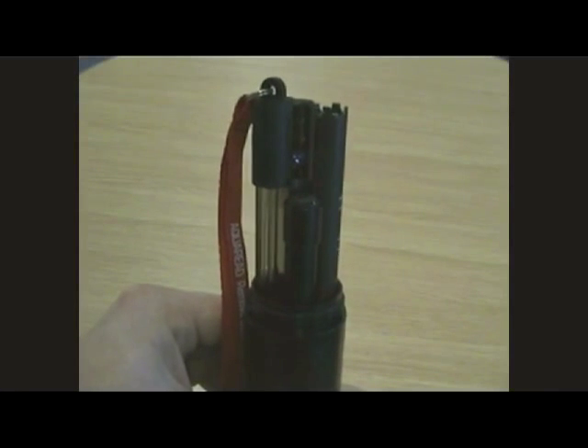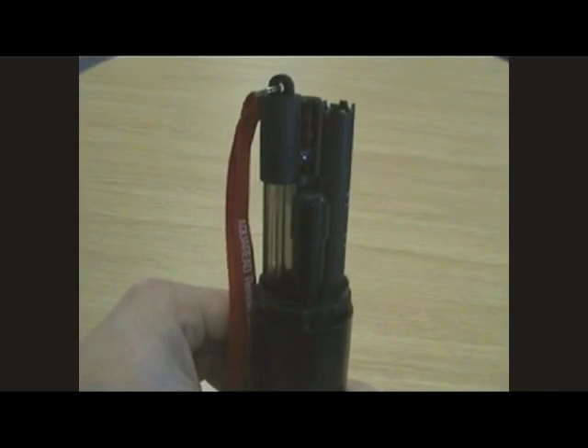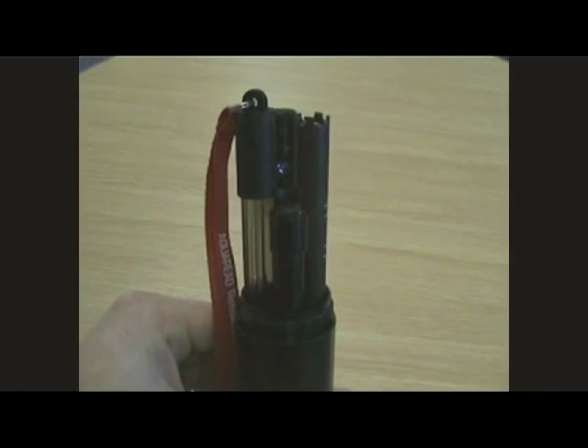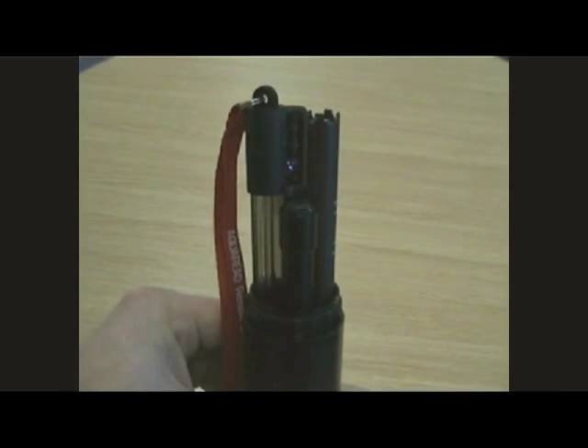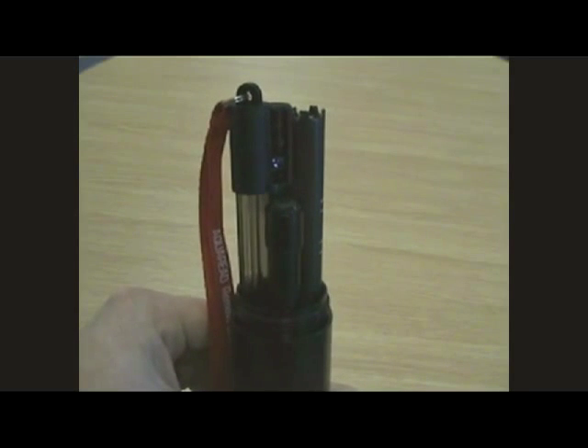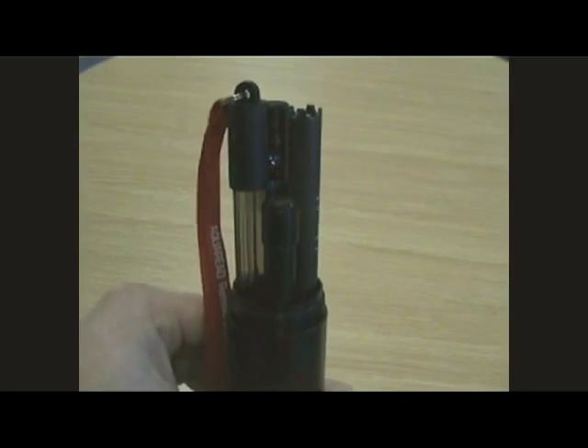Our probe directly measures pH, dissolved oxygen, turbidity and conductivity. In addition, we are able to calculate resistivity, total dissolved solids, salinity and other parameters. Here's a full list of all the parameters AquaRead are able to offer you.